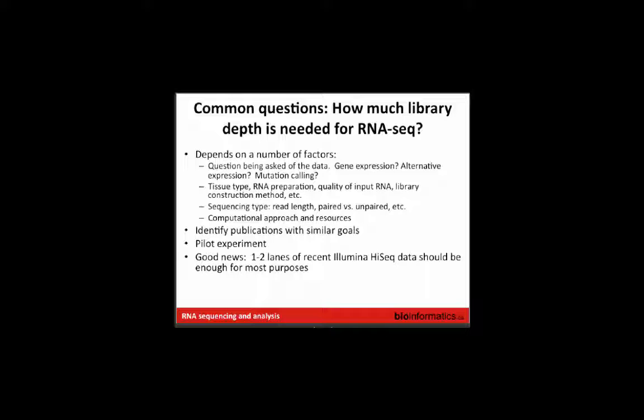When you say one lane per sample, is that referencing gene expression, differential gene expression, or are you more... So we do quite a few of these applications. If we just wanted differential gene expression, it probably would still be overkill, yeah, for sure.